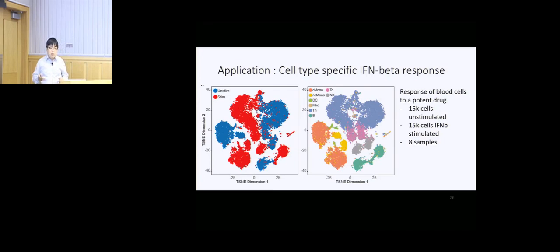In this case, we even loaded more adventurously. We loaded 15,000 cells because now we know that this method works, and we know that loading more samples is going to be more advantageous as long as our method is close to perfect.